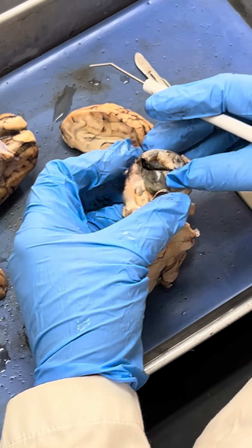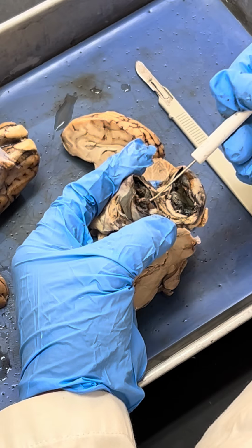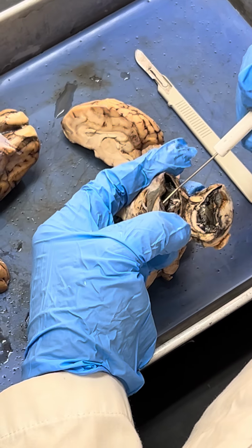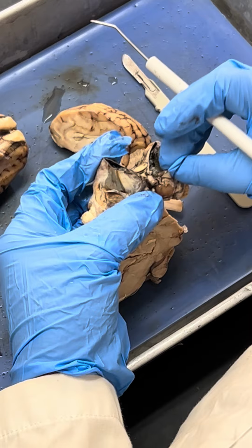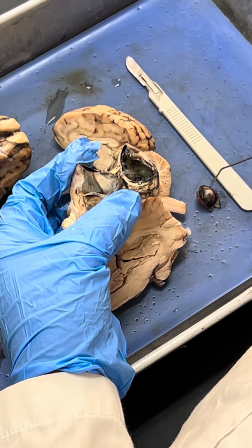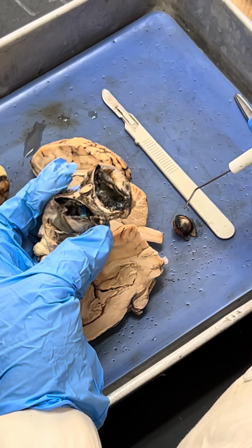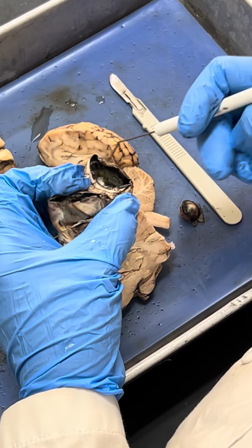Now, if you open it, what is this? Can you tell me what is this? This is the lens, right? This is the lens. And the black is the iris surrounding it. Now, inside, few things.